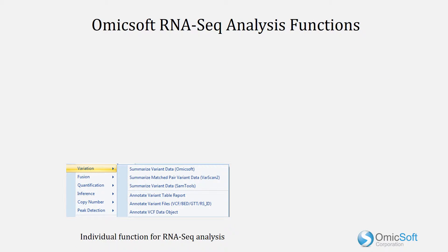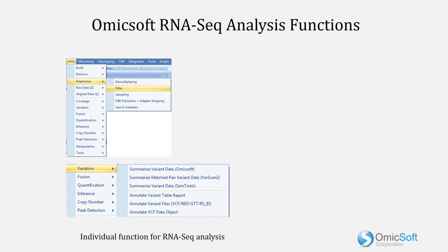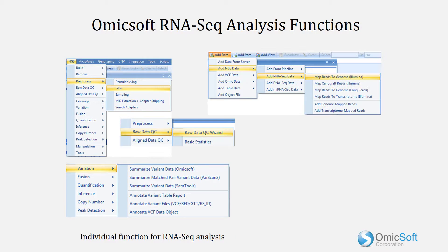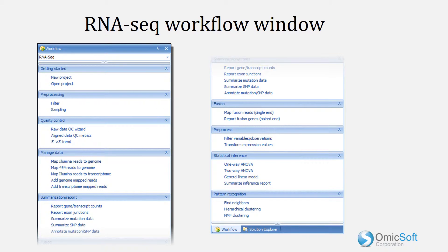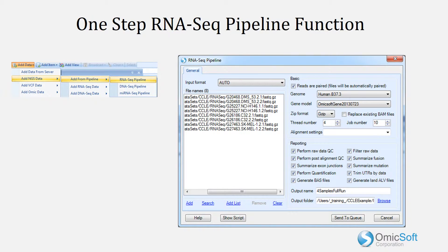Each step of the RNA-seq pipeline can be accessed in menu functions, where each function can have additional parameters that can be set by the user. Similarly, users can follow a recommended workflow from start to finish. However, the simplest way to perform standard RNA-seq analysis is using the RNA-seq pipeline.